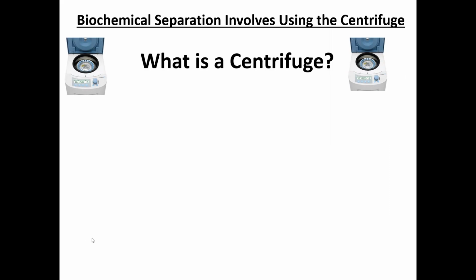All right, guys, so welcome to experiment number 3. Our main focus in this YouTube video is on the centrifuge. The centrifuge is very instrumental in biochemical separation. Without the centrifuge, you cannot perform biochemical separation. So what is a centrifuge?